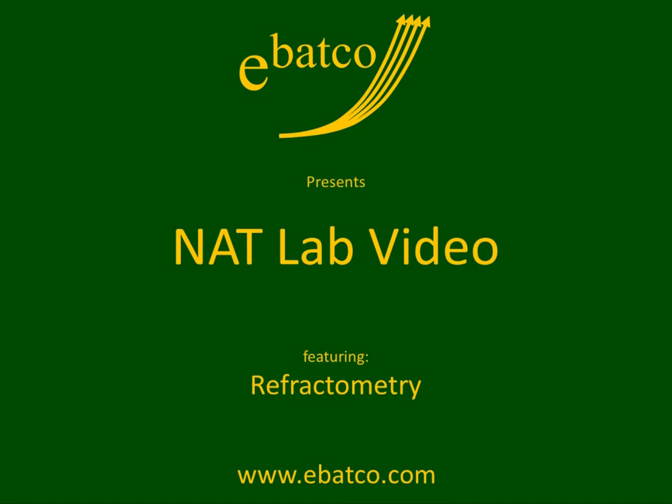Hello and welcome back to another installment of the BatcoLab video. This video will take a look at a quick way to measure sugar concentration via refractive index.